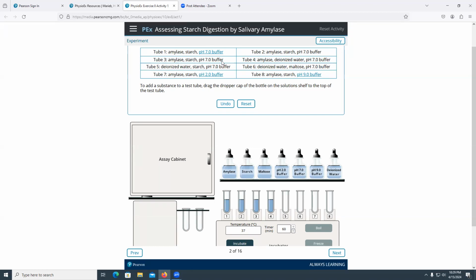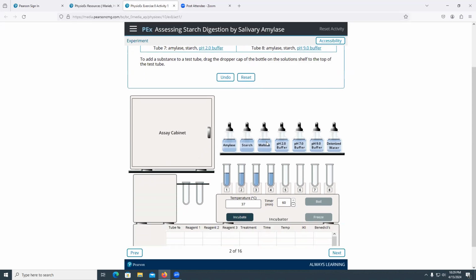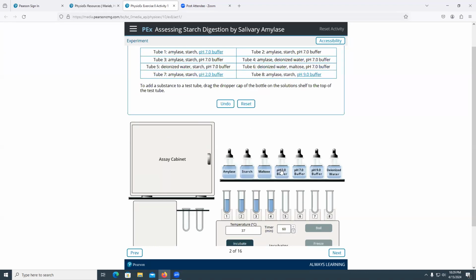But if we are at a non-favorable temperature, we will have a reaction in the end. We will have reactants turning into products. But when we assess, it will never be from blue to red, because that signifies that I do have an enzyme operating at optimal capacity, but here I don't. So it will be from blue to, for example, green. So there's just a little bit of product formed.